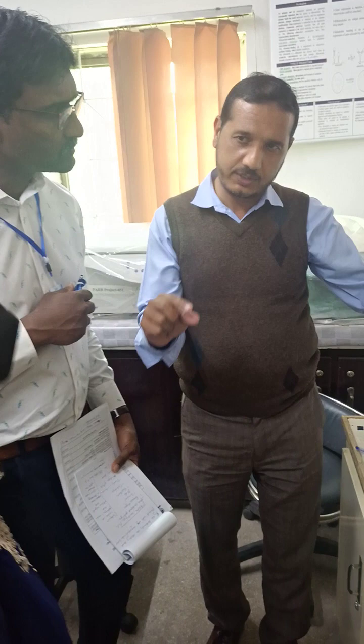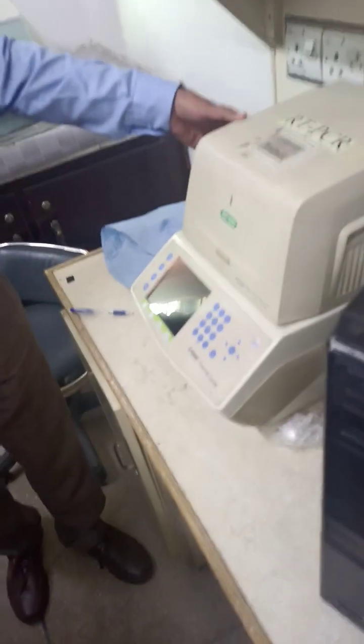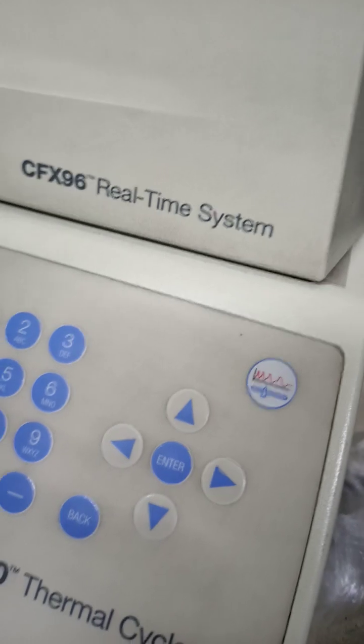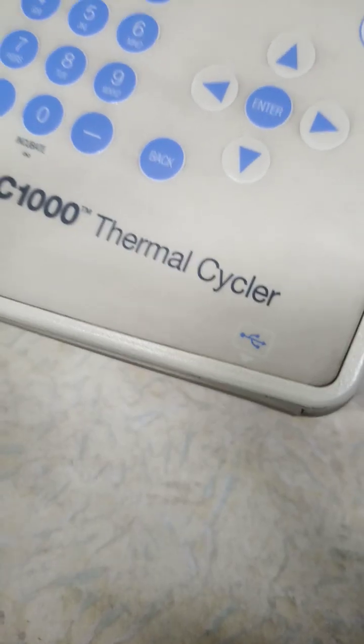Because the signal of the fluorescent dye is exactly proportional to the quantity of the amplified DNA. As much as is the fluorescent dye, that much would be the amplicons. That's why we call it real time. It means you can track the amplification at the same time as well as you can quantify what the amplicon or target is.